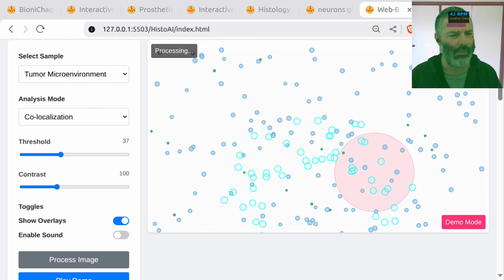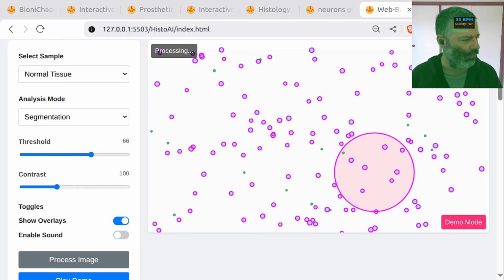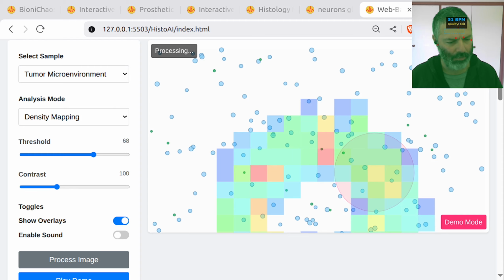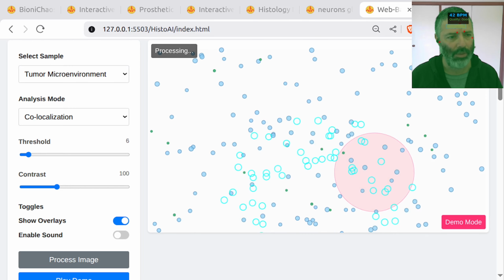Following, enable the on-the-fly processing. That's the previous thing we did. Yeah, so we're cycling now through the different analysis modes. That's okay. Okay, and we have another prompt. So in theory, it should modify the code straight away. Maybe not.